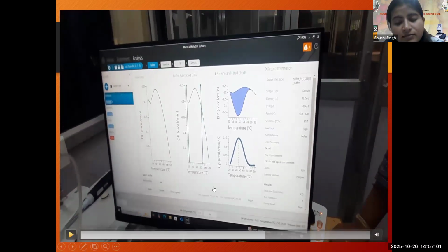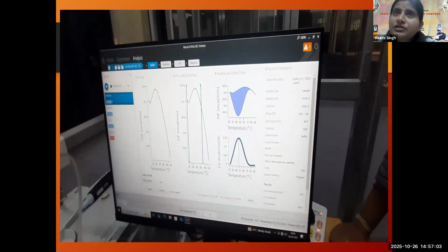So DSC not only has its application in food.